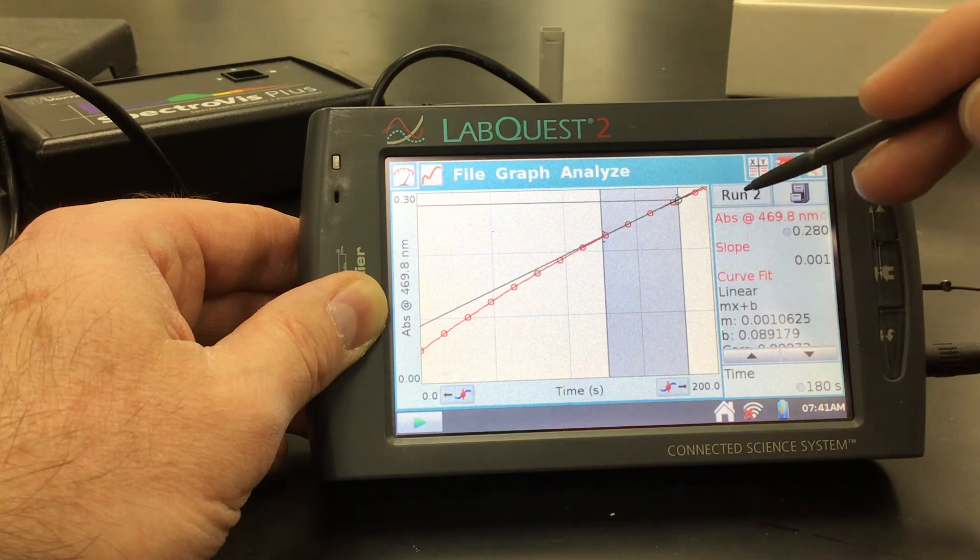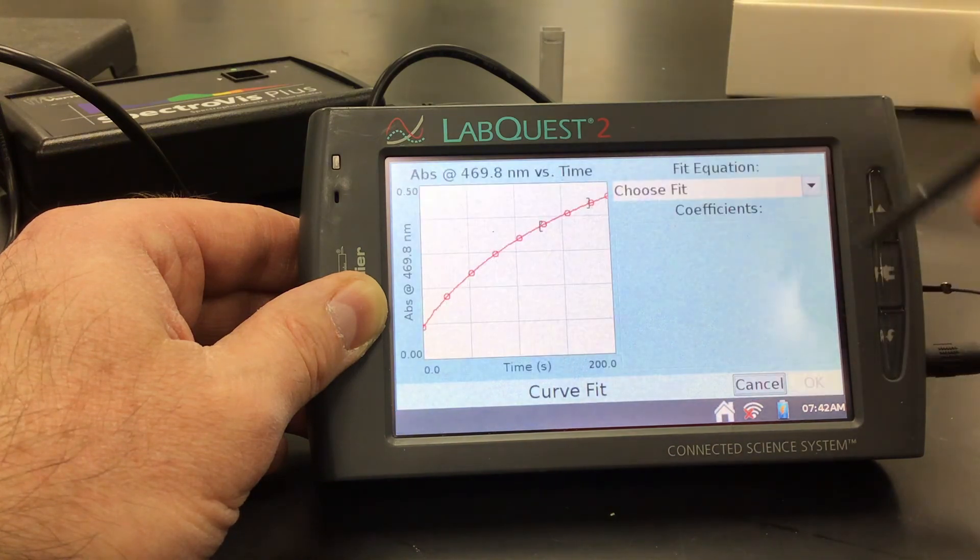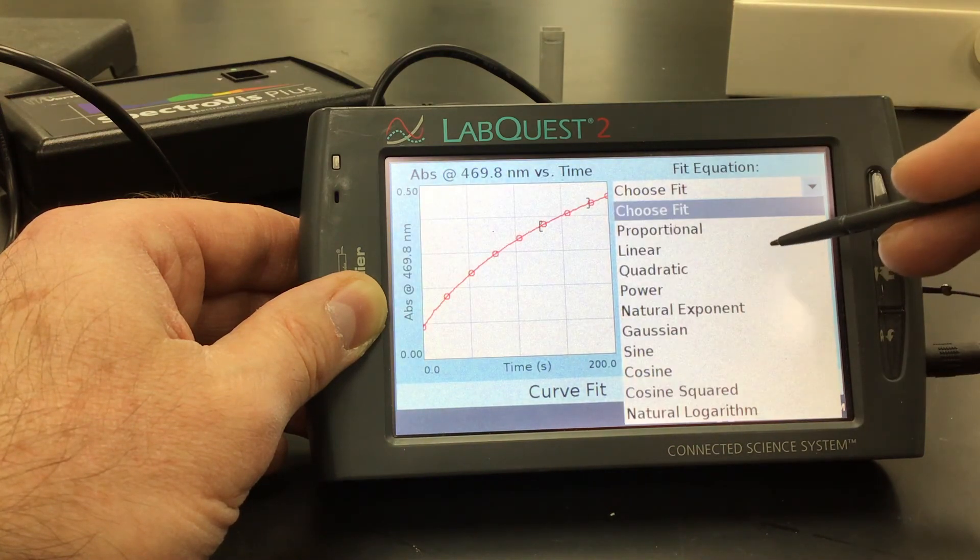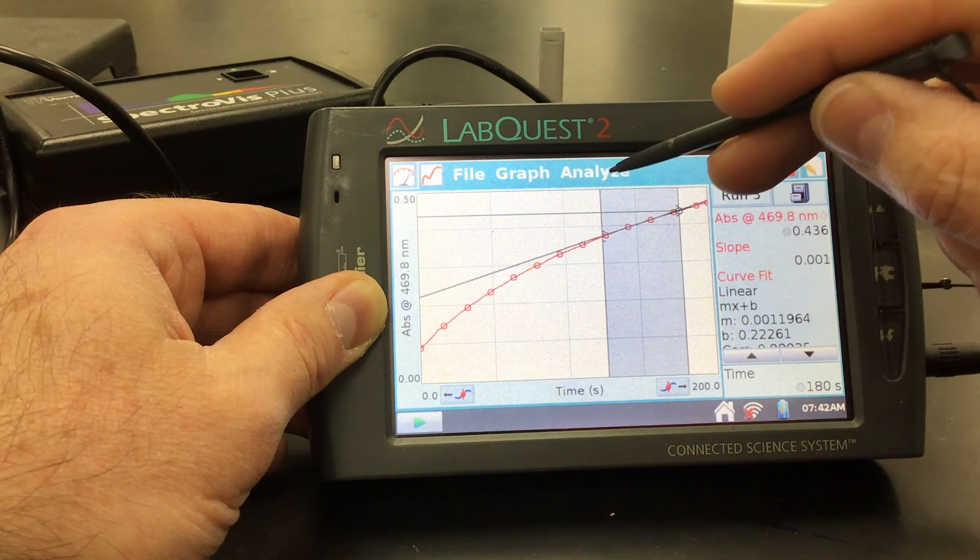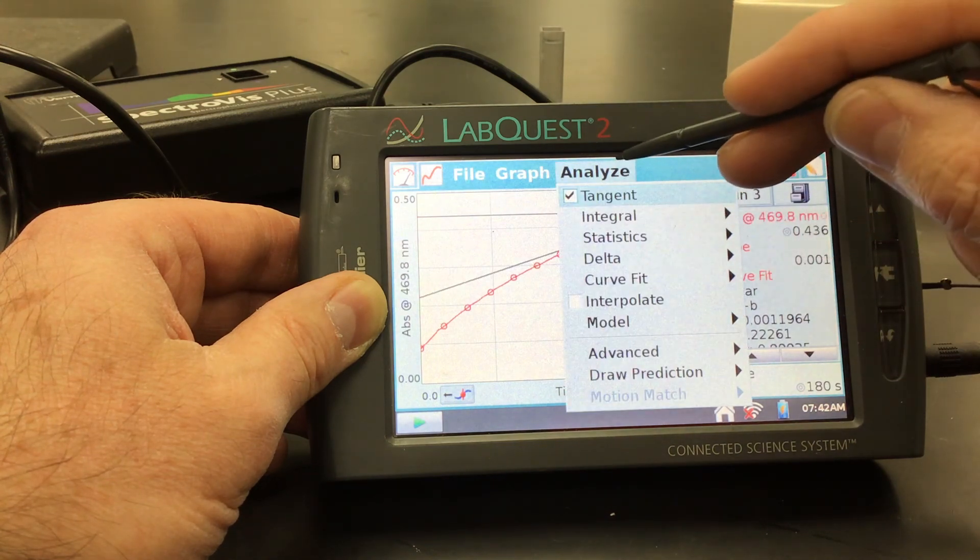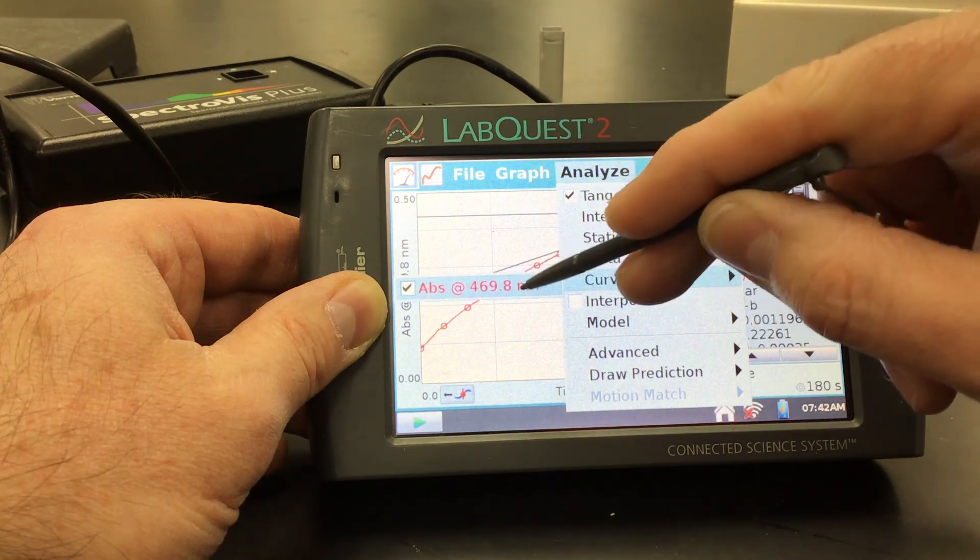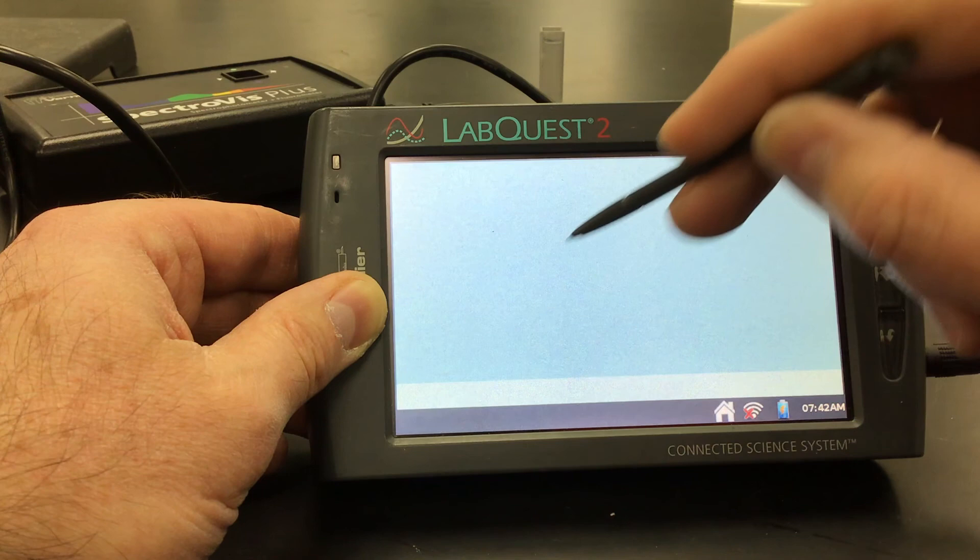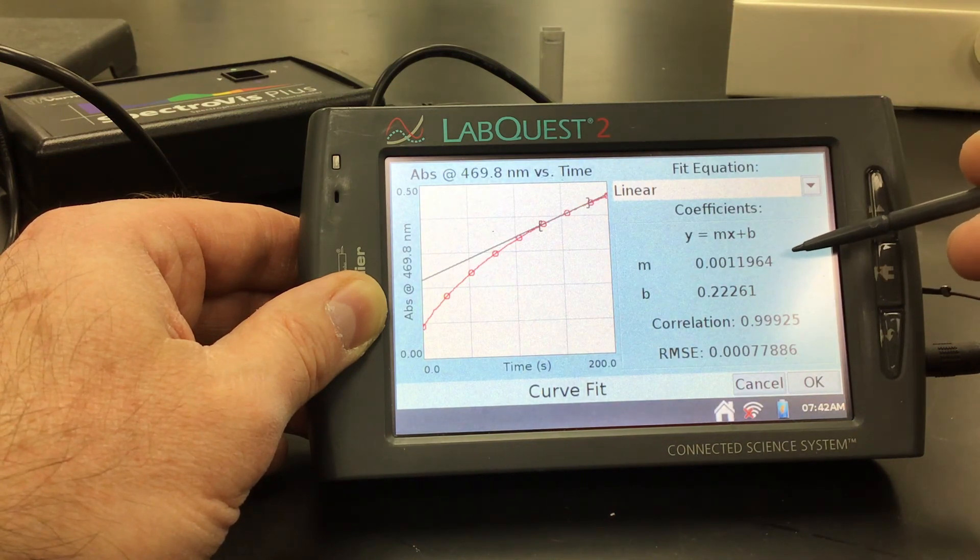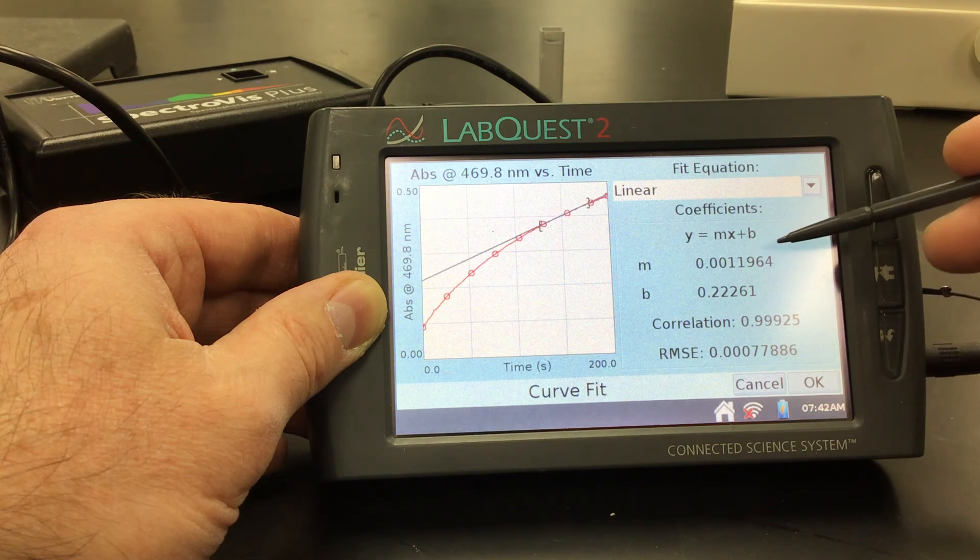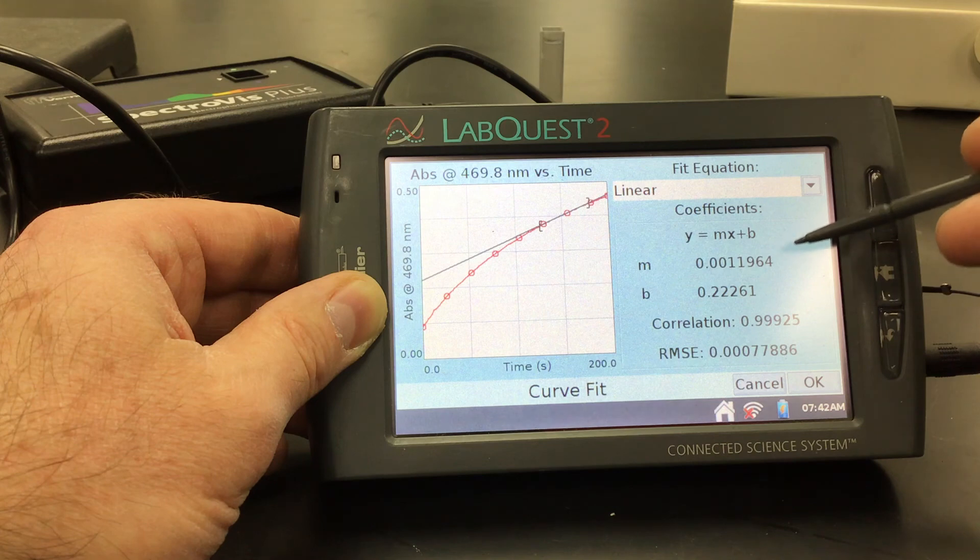And then lastly, we'll do our third run. Same idea. And then let me go actually go back and to see what that was. I did it really quickly here. Go back and do it again. So for our third one, we had our initial rate as 0.0011964. That's our initial rate, which is our slope.